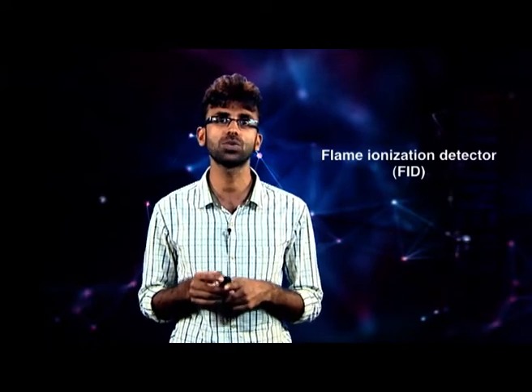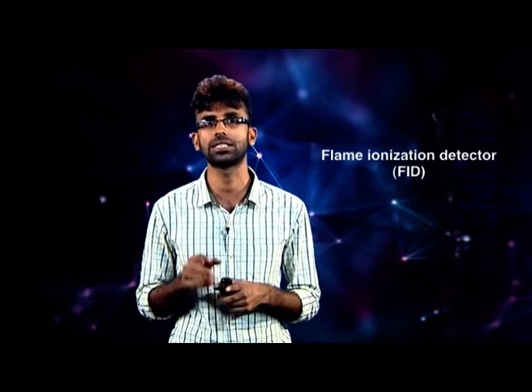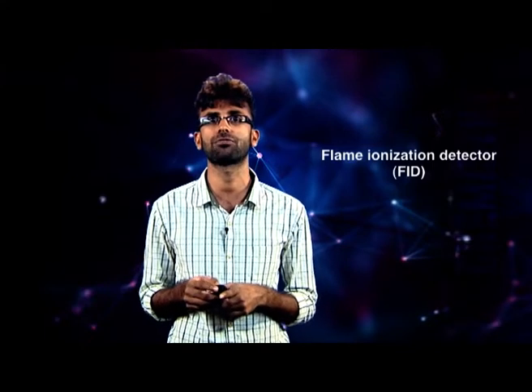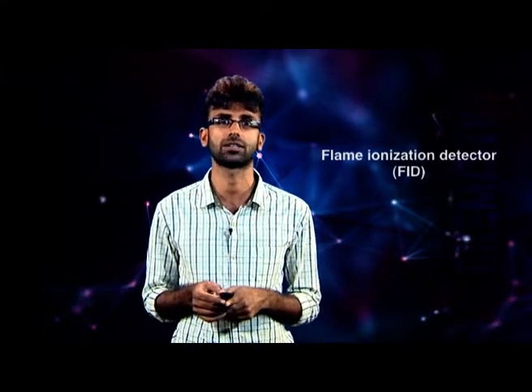Another detector is the flame ionization detector, or simply FID. Ionization detectors are based on the electrical conductivity of gases. FID is the most widely used and generally applicable detector for any type of gas chromatography. It operates on the principle that there is a change in the conductivity of the flame as the component is burnt.